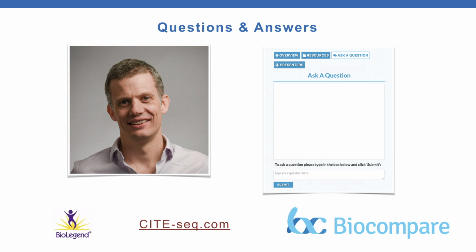Very clearly we could be missing some sort of information here. There's some very interesting work going on in looking at RNA velocity and things like that, and I think Leo Pachter's group put something out about RNA acceleration recently, which takes velocity and then includes protein data as well. So I think there's probably some very interesting information there to be gained. It's not something we've specifically looked at.